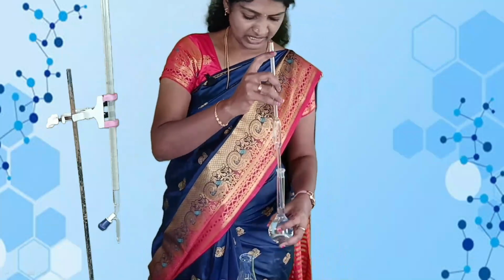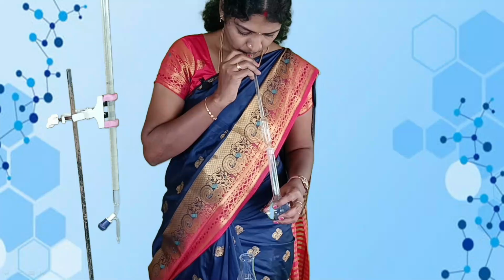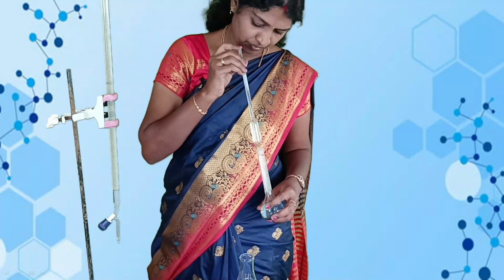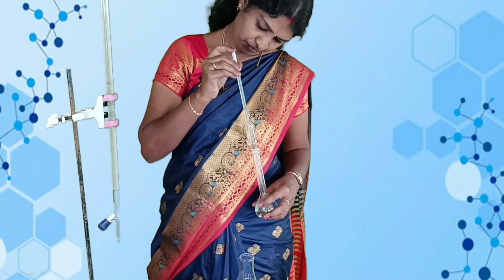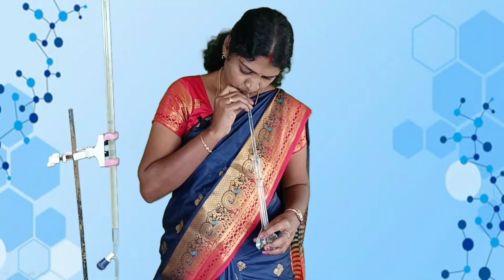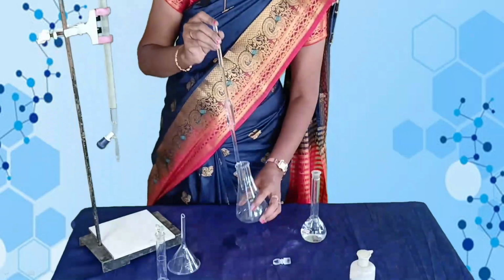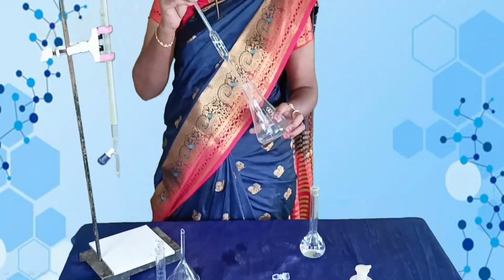Pipette out 20 ml of oxalic acid and pour into a clean conical flask.